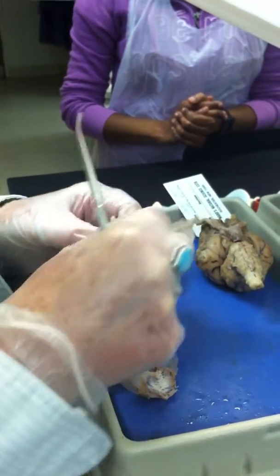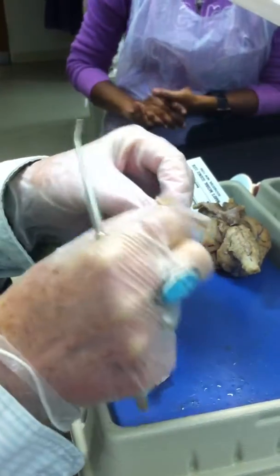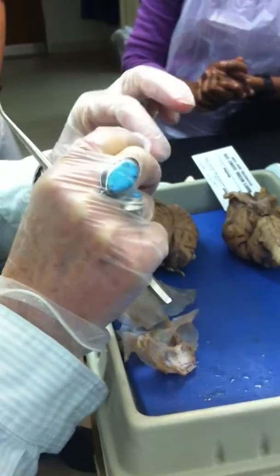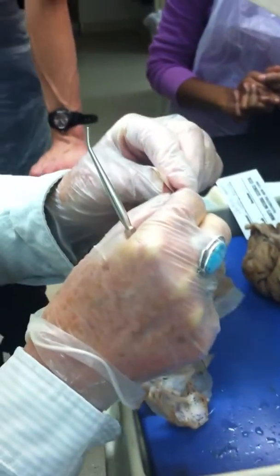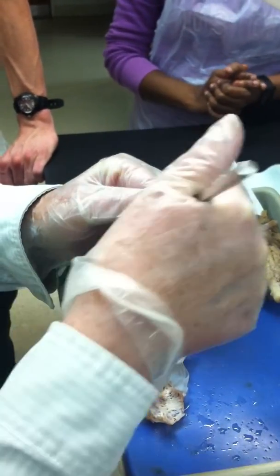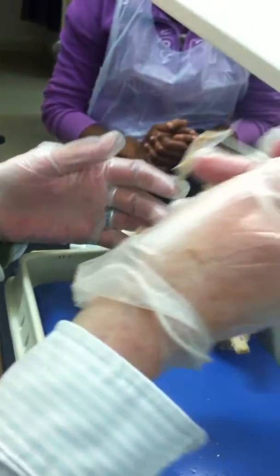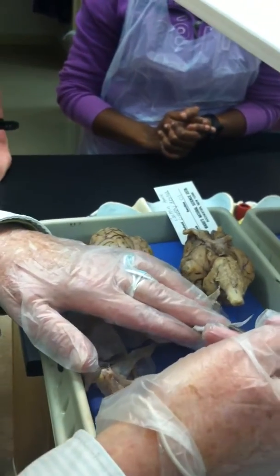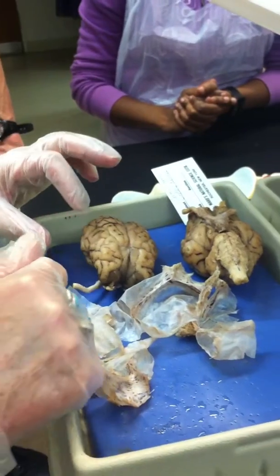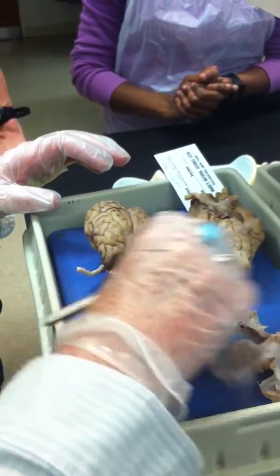Also, the meninges. Although I can't see exactly where, I think this is where we went down for the sagittal sinus. And if you look really closely in there, you can see that sure enough there's a space there, all right? And that's where the cerebrospinal fluid will be sucked in, okay? Because remember, we're making a lot of it at any given time.